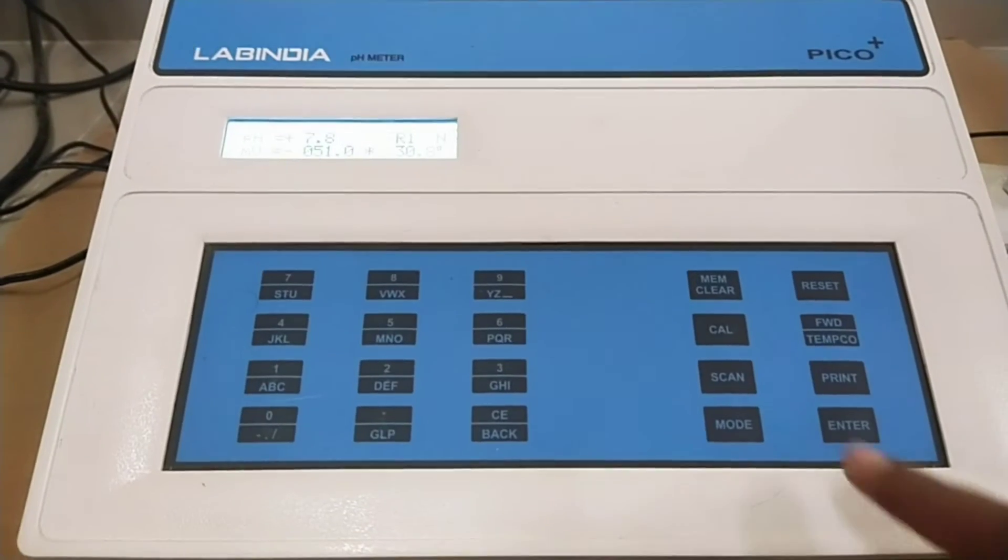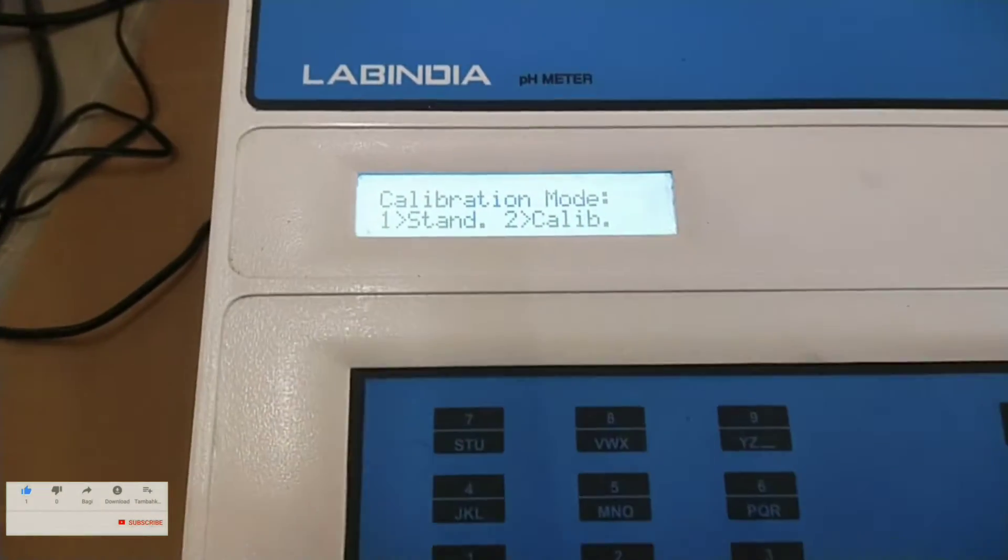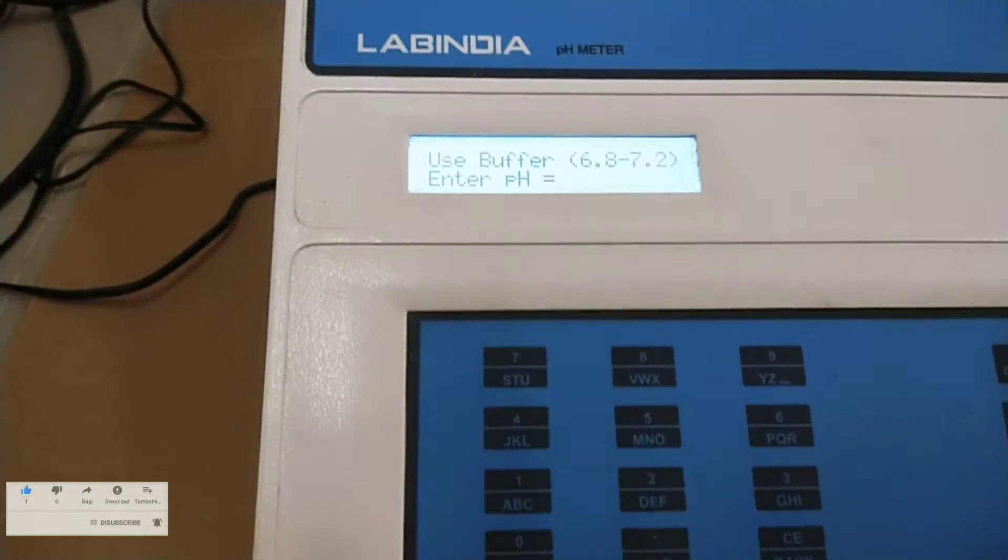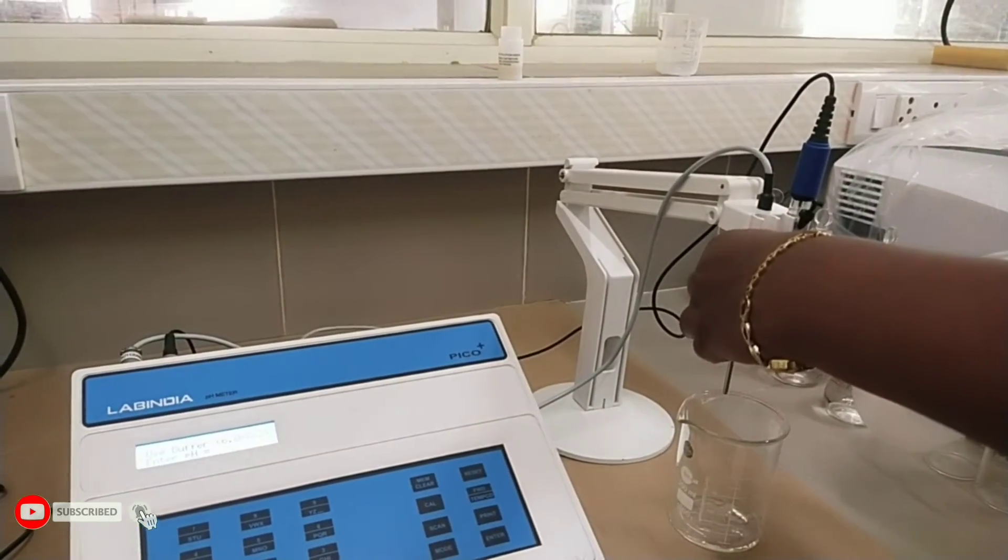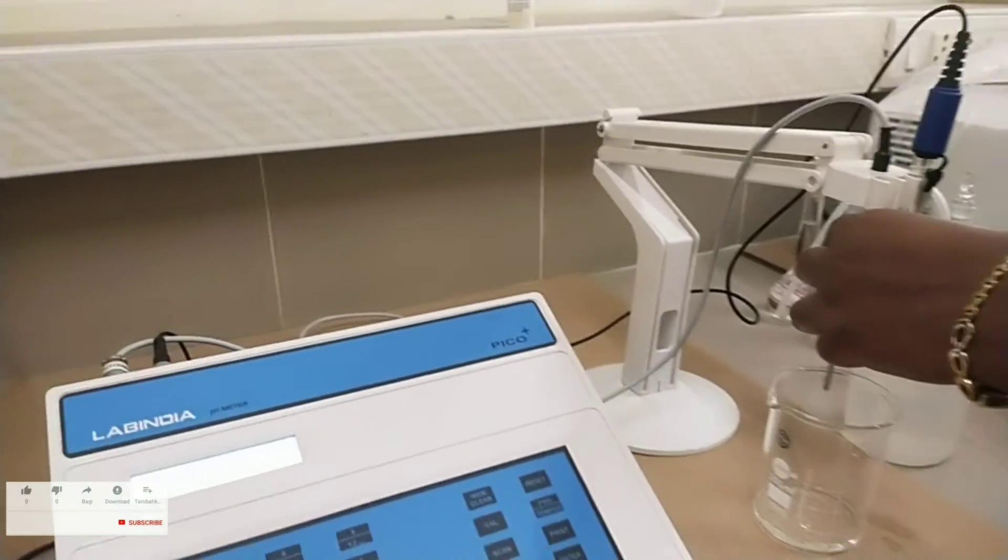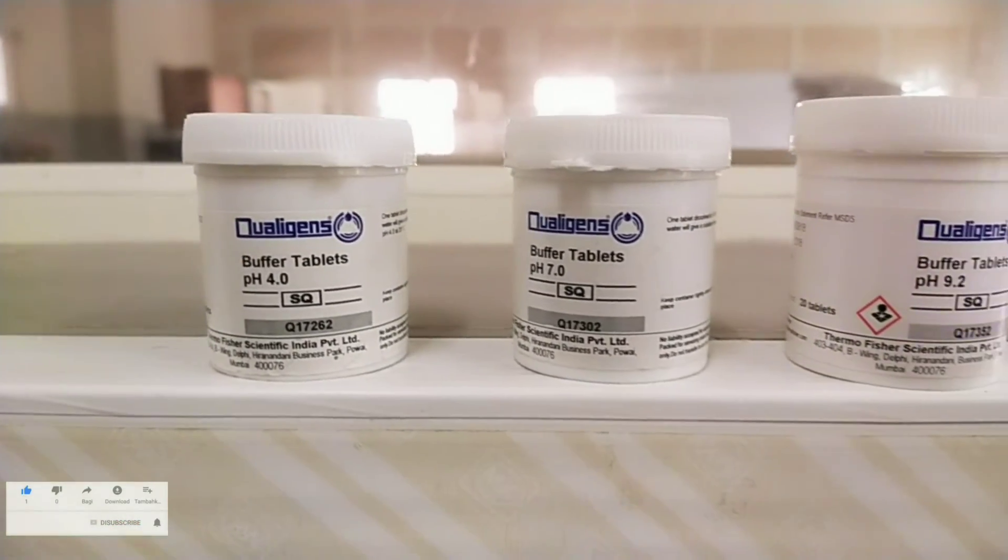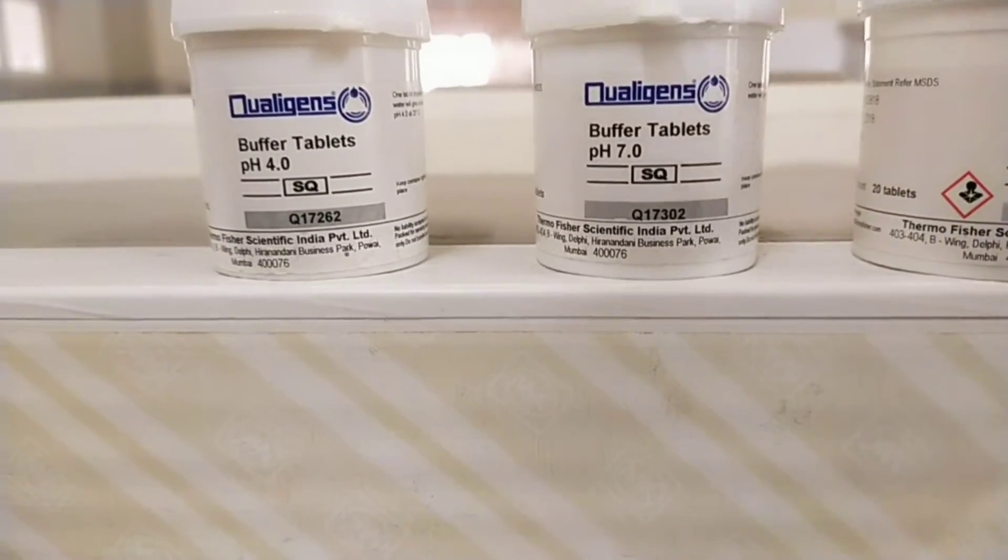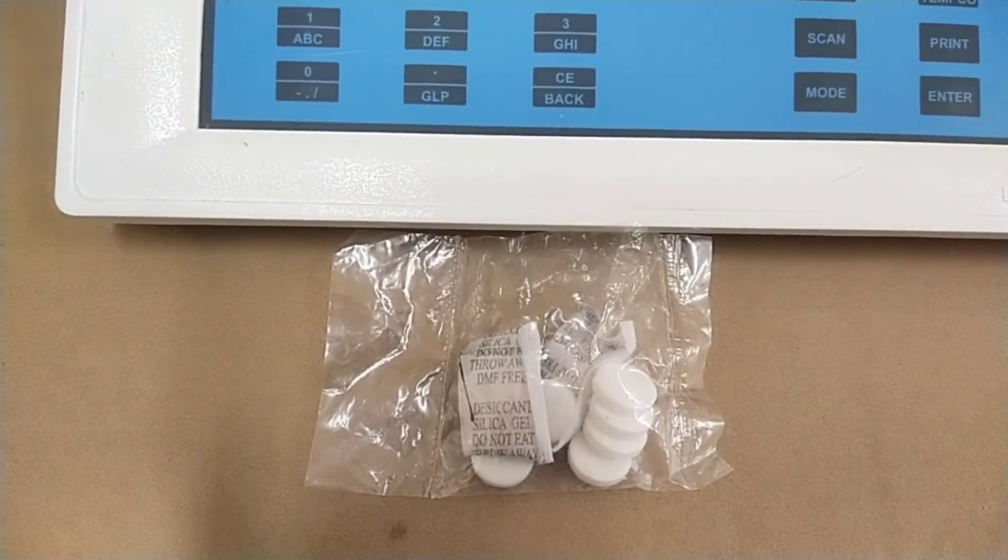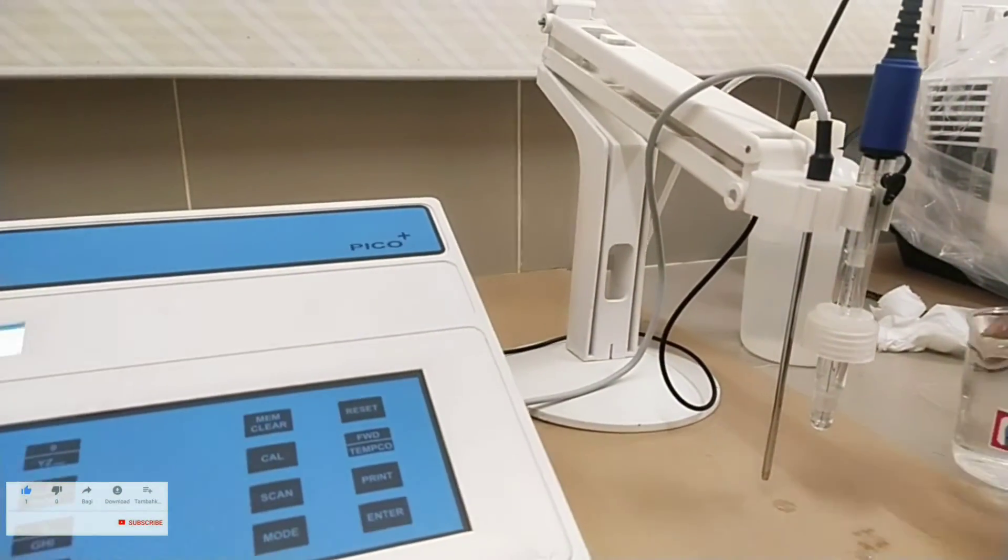For calibration of the instrument press call key. It displays calibration mode. Now press 1. Then press enter. Now the instrument asks buffer between 6.8 to 7.2. Before calibration rinse the pH electrode 2 to 3 times with distilled water. Remove the excess water by soaking it with tissue paper. For doing calibration buffer preparation can be done by using buffer tablets: pH 4.0, pH 7.0, pH 9.2. You can observe buffer tablets.